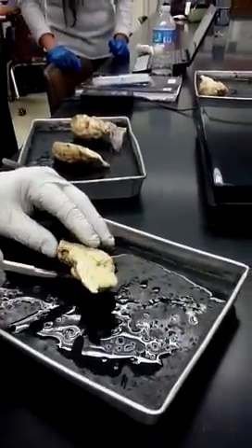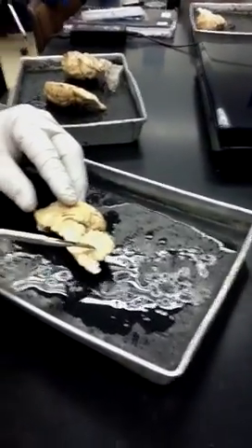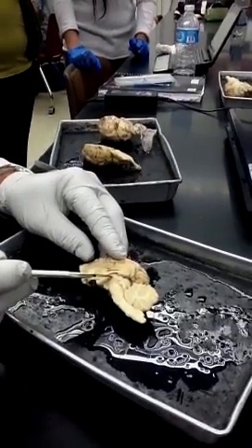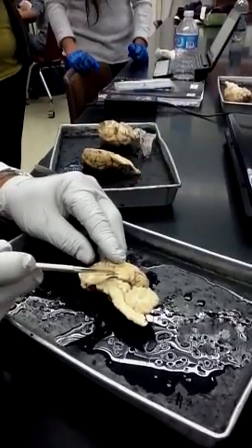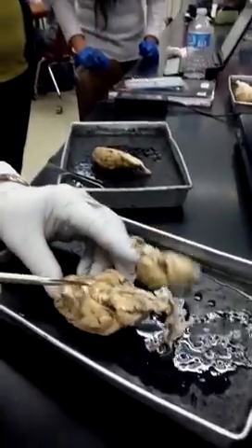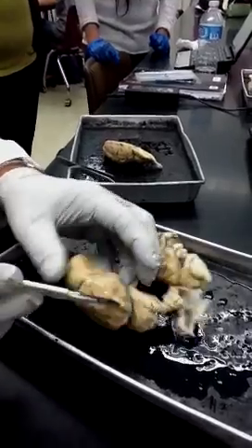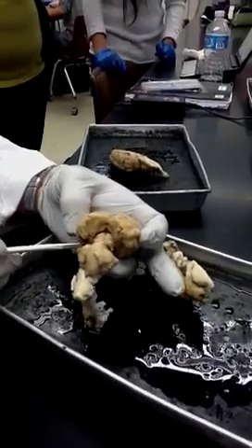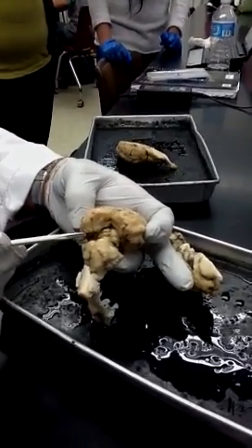I want to see how it looks, by the way. Tree of life, cerebellum, pineal, thalamus, hypothalamus, lateral ventricle, corpus callosum, optic chiasm, olfactory bulbs. Am I still on? Corpora quadrigemina, inferior colliculus, superior colliculus.